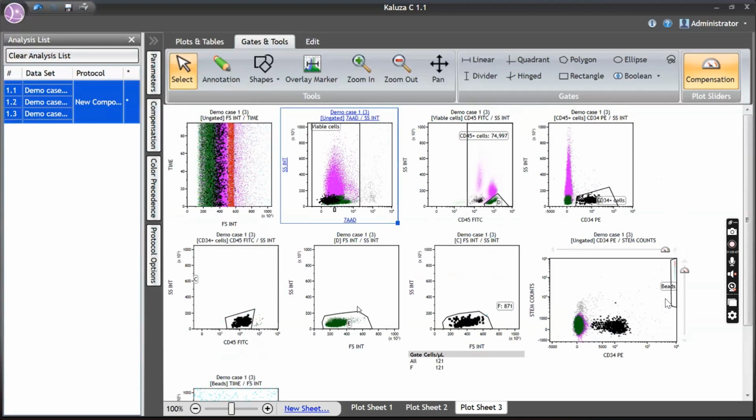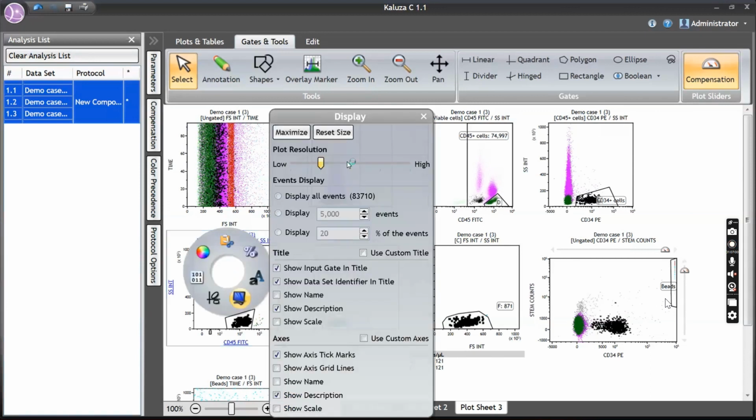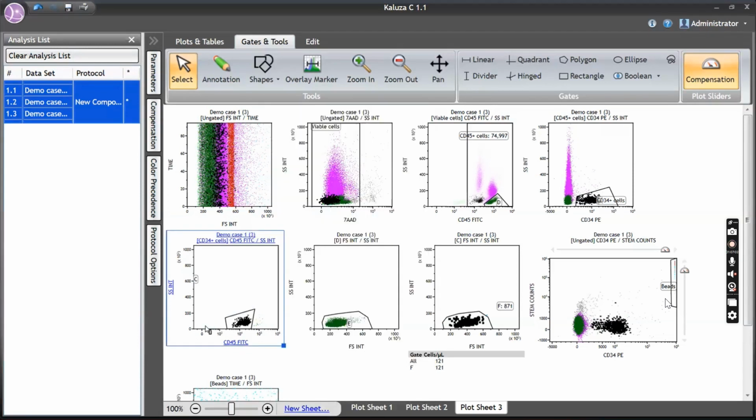Okay, it should be done under supervision. Though it is a locked protocol, you need to check, because debris sometimes can give you a lot of nuisance. It can give a false elevated CD34 count. So you need to be very careful. Okay. So if your lab is doing CD34, ask them what protocol they are using. Is it locked or open protocol? And how are they doing it, sequentially like this, or is it already set? Nothing wrong if it's already set. Before signing it out, check it once that everything is perfect. Okay, that is my suggestion.